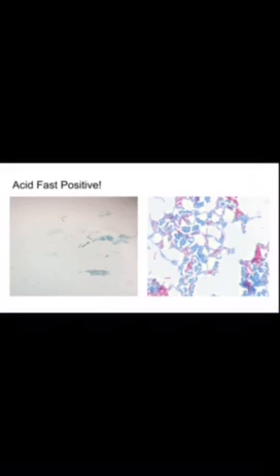I decided to use a sample from a nutrient agar slant that I had been storing at 25 degrees Celsius. I wanted to obtain the smallest amount of sample as possible to avoid clumping, so using aseptic technique and the needle, I obtained a pinpoint amount of bacteria to mix with water on my slide. Following the directions to a T, I performed the acid-fast procedure again, only this time, success. I had a feeling that my results would not be impressive due to the amount of time that had passed and the possibility of dead bacteria.